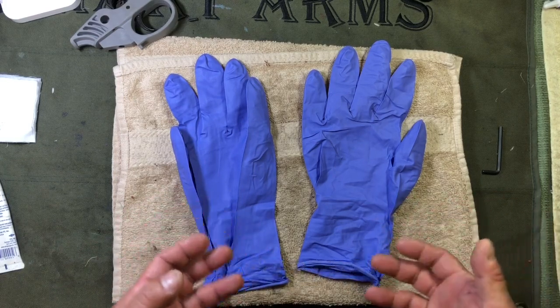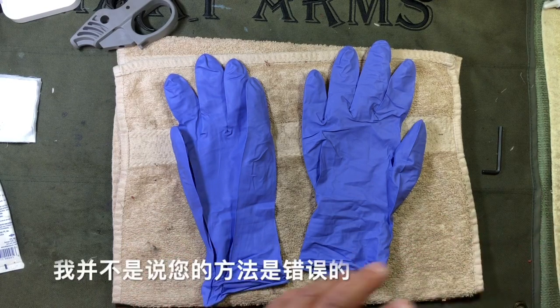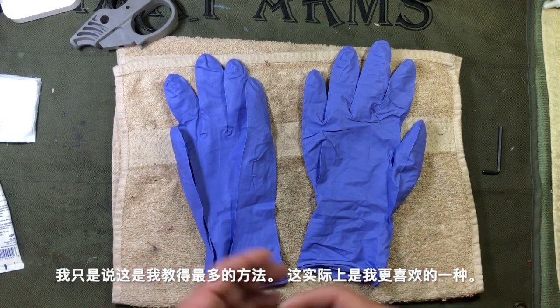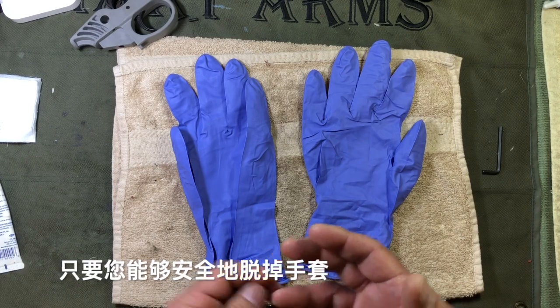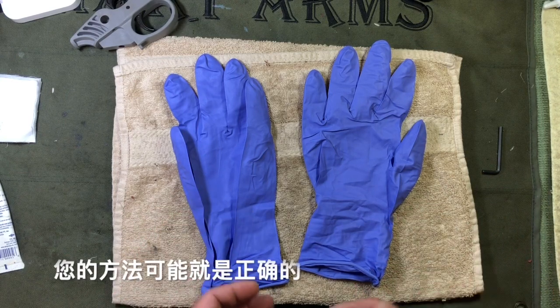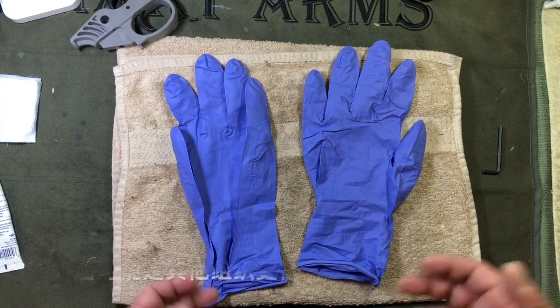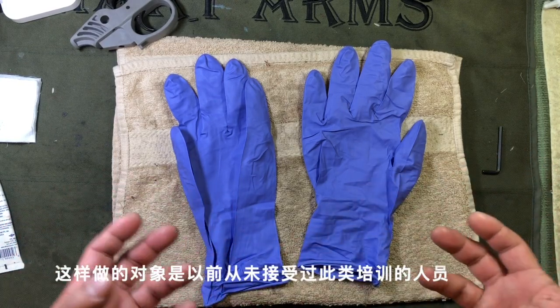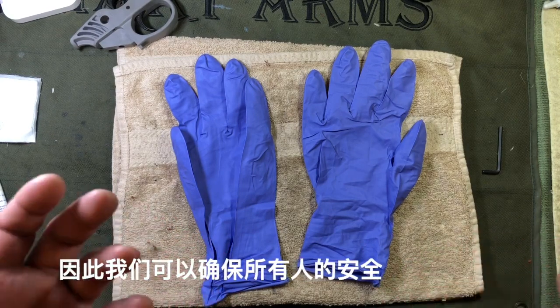This is the methodology that the American Safety and Health Institute actually teaches. If you learned a different methodology and it looks a little different, I'm not saying your methodology is incorrect. All I'm saying is this is the one I teach the most and the one I prefer. As long as you're able to take your gloves off safely without contaminating yourself, your methodology is probably fine. This is going to be done just for folks who have never had this sort of training before, so we can keep everybody safe.